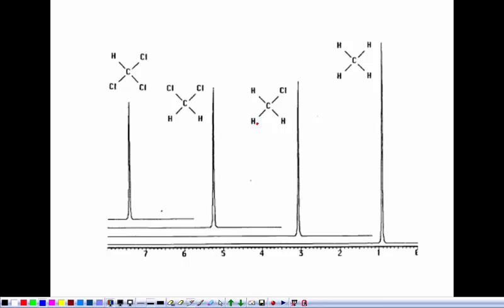When we look at the scale on an NMR, all we're going to see are numbers from 0 to 12. Well, 1 means 1 part per million, which on our instrument means that that peak is 300 hertz away from the 0 TMS. On a 500 instrument, it would mean that they are 500 hertz away with an operating frequency of 500 megahertz. So it's always going to show up at the same? It's always going to show up at 1, yes.